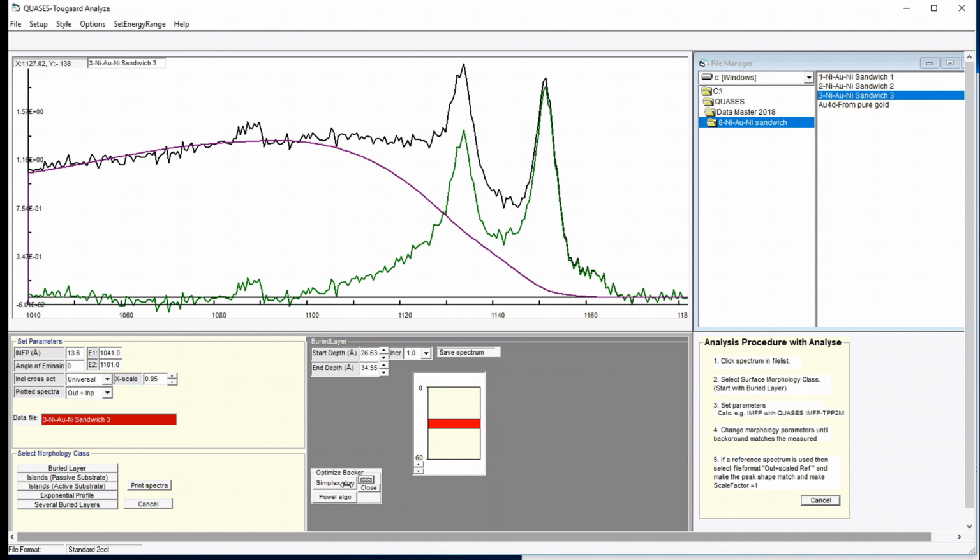The two algorithms differ in the way they steer towards the minimum. I've found, in a lot of examples, that simplex is practically always faster than the Powell algorithm, but they give about the same answer. So normally you would just be using the simplex algorithm.